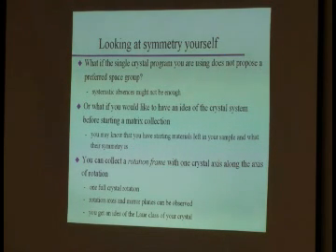So in these cases it might help if you are able to look at symmetry yourself. Okay? There are times when you have to do that. In the ideal world, with an ideal crystal, yeah, the program's going to do most things for you. But trust me, life is rarely ideal. There will be times when you have to interact with your data. If you go into protein crystallography, you certainly have to do quite a bit of work. It's not quite as automated. If you deal with powders, you certainly have to do some crystallography and some work, okay?